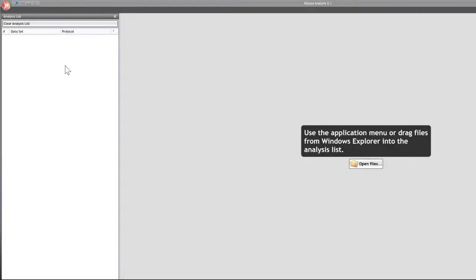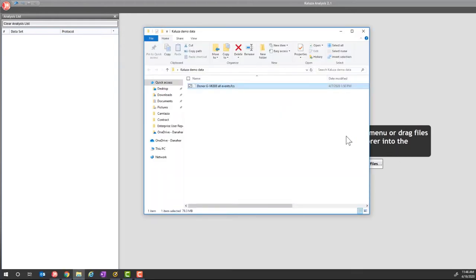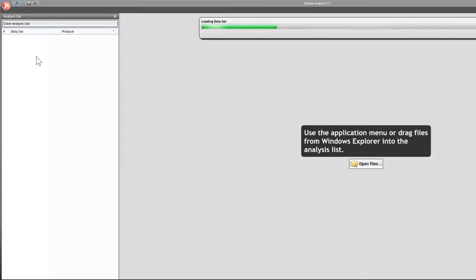This video is going to walk you through how to use the Kaluza Cytobank plugin to upload processed files to the cloud for further analysis. To begin, we're going to import files into the Kaluza analysis list. The preferred approach is to open up a Windows Explorer folder that contains your data files — you can do this with one data file or multiple data files at the same time — and simply drag and drop into the analysis list to load the data file into Kaluza.